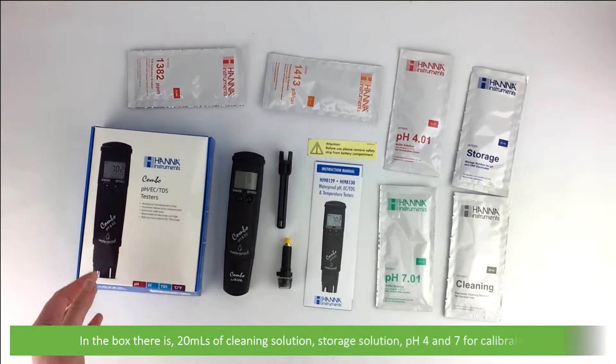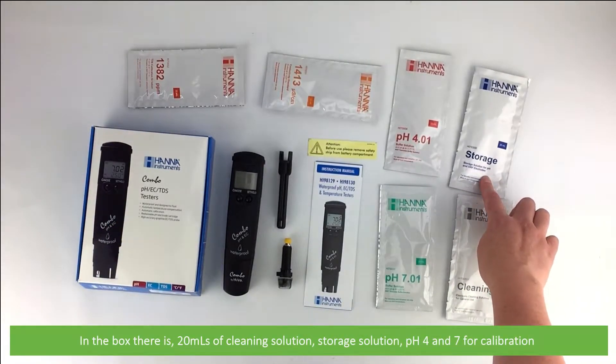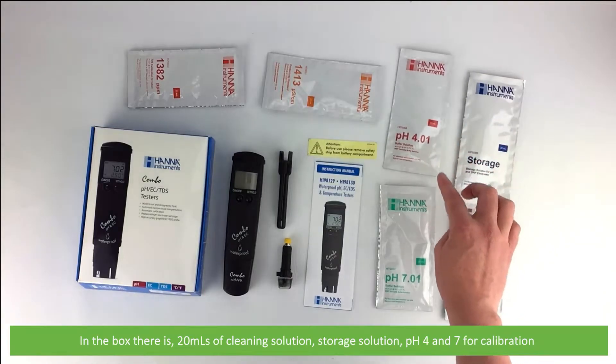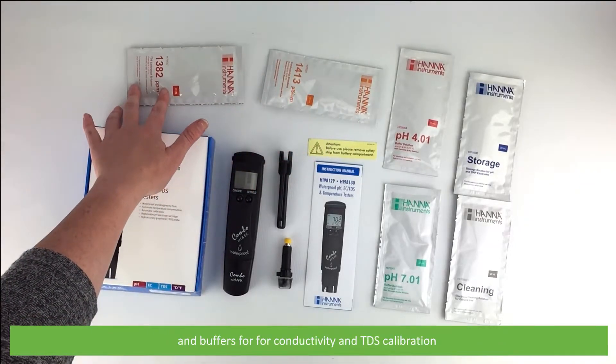In the box there's 20 mils of cleaning solution, storage solution, pH 4 and 7 buffers for calibration, and buffers for conductivity and TDS calibration.